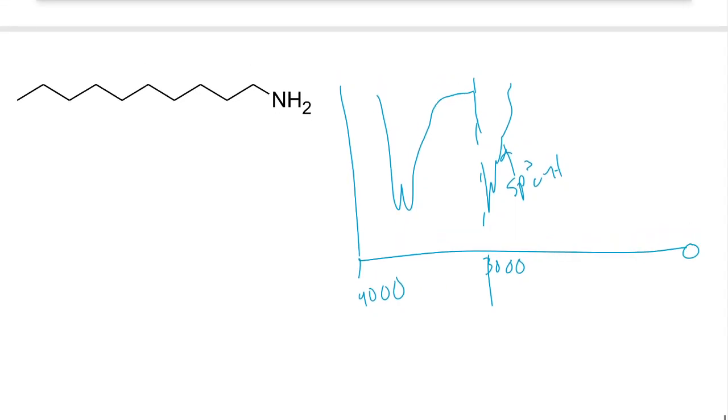Okay, so I think we've covered the major functional groups that we wanted to cover the interpretation of for IR.